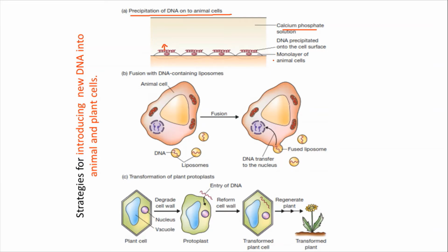This is an animal cell. This is a treated animal cell, a protoplastic animal cell, and it is also fused with liposome based DNA. This circle forms the liposome.